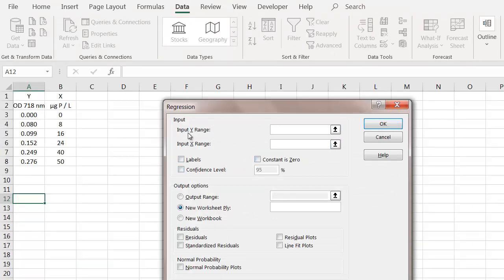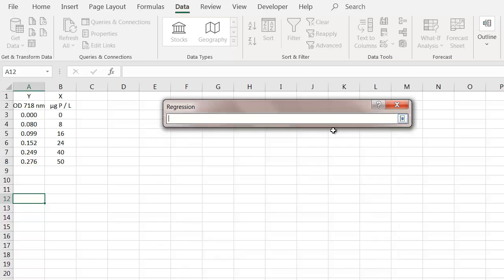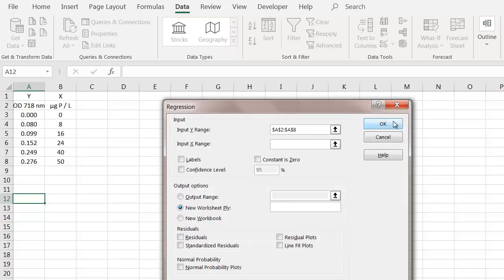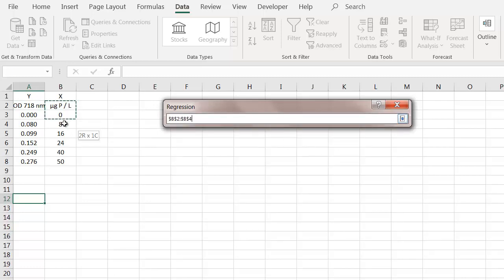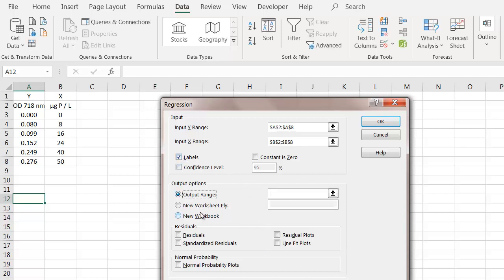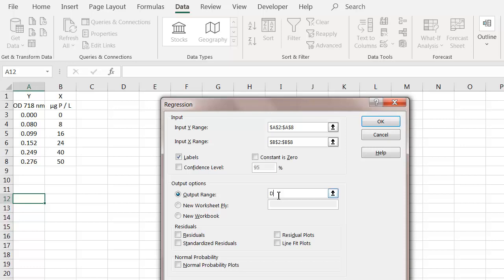You can see here's the dialog box. First thing, it asks you, where is your Y-data? Click this box. Highlight the Y-data. Make sure you include the labels. Click that. For the X-values, click the box. Highlight the X-values. Make sure you include the label. Then we're going to click the label box, since we included the label. We're going to tell Excel where we want it to print out. In this case, I'll put it in cell D1. And then finally, click this button that says line fit plot. Click that. And you're going to press OK.